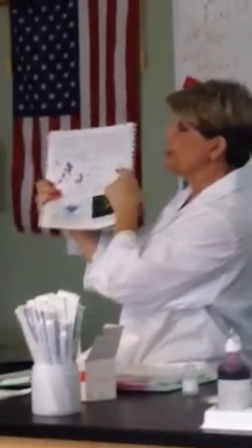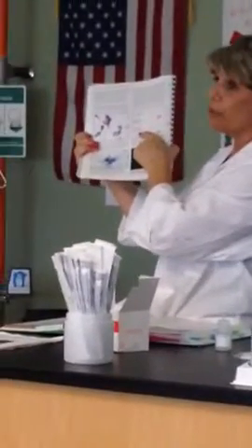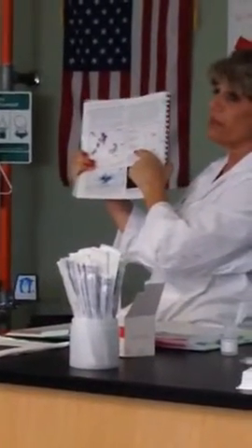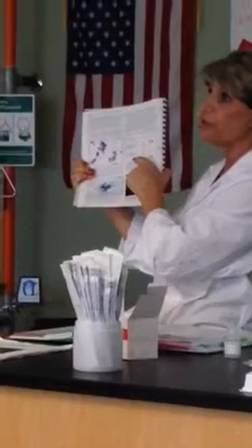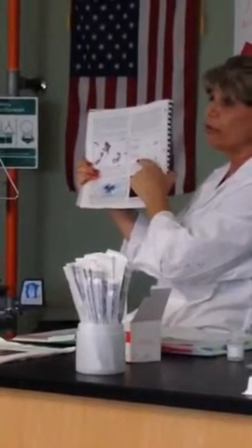Once you add the primary stain, which is carbol fuchsin, which is pink, everything's going to turn pink. Then you decolorize by drizzling acid alcohol over your bacteria. And then you have to rinse quickly, because if you leave the acid alcohol on there, it's just going to dissolve everything. So drizzle it, a drop over one little circle, a drop over the other little circle, a couple of drops over your oval, and then grab your squeeze bottle and rinse it.